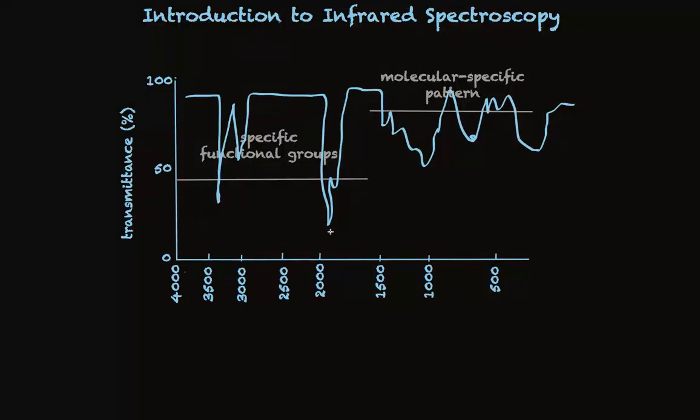These specific absorptions in the left-hand region come at frequencies that are distinctly characteristic of certain functional groups. And so we can look up in a table the specific frequencies where we see absorptions, and it will tell us what kind of bonds are likely causing those absorptions. On the other hand, the region on the right is a complex pattern, and it's typically pretty difficult to interpret in terms of specific functional group atom bond absorptions. But rather it has a distinctly different use.